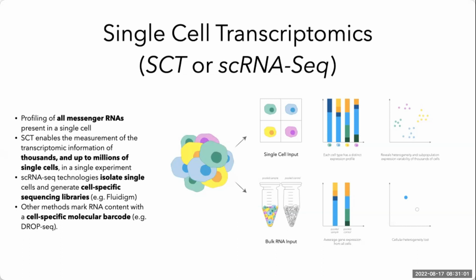It will also help us discover new cell populations or novel tissue types, and order or arrange cells within a developmental trajectory to understand the differentiation pathways and functionalities that govern the developmental trajectory of these cells.